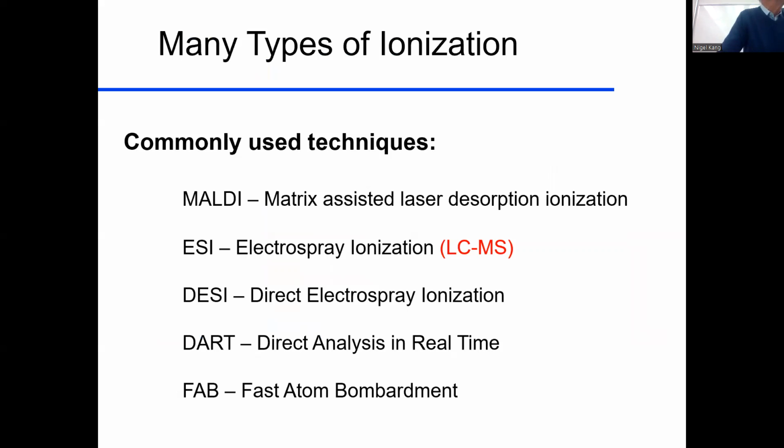So that's electron impact. Like I say, that tends to be the workhorse of what we do, certainly in the foods business. That's the workhorse by far. And if you get into research and other areas, there are other ways to blow this molecule into pieces. So these are other techniques that are used. MALDI, matrix-assisted laser desorption ionization, is one way of blowing the molecules up, and we'll see what each of these are.